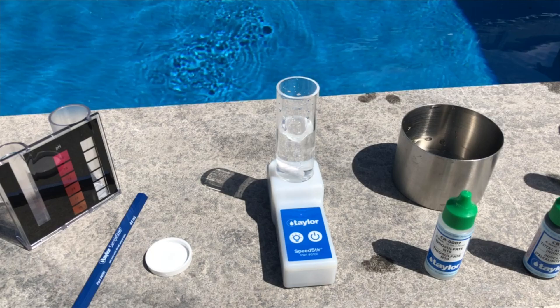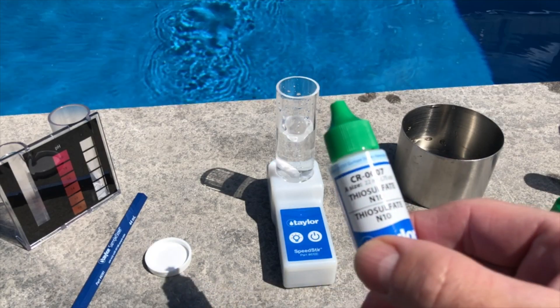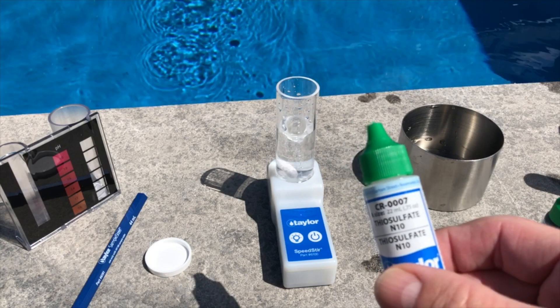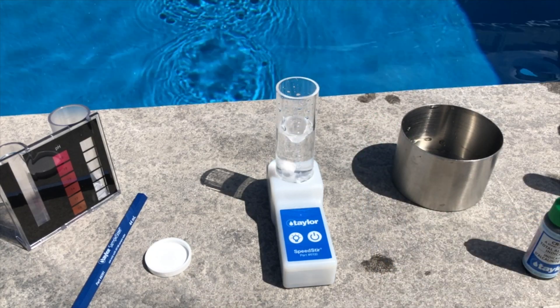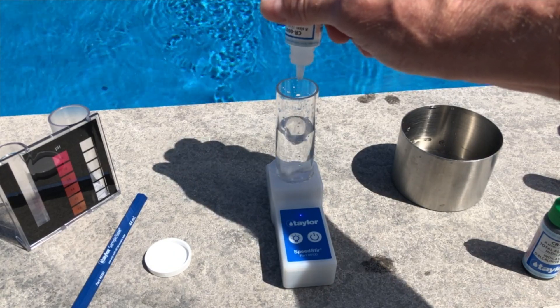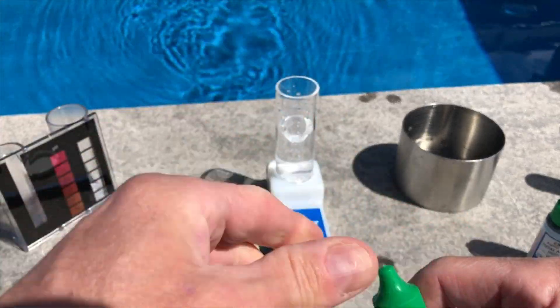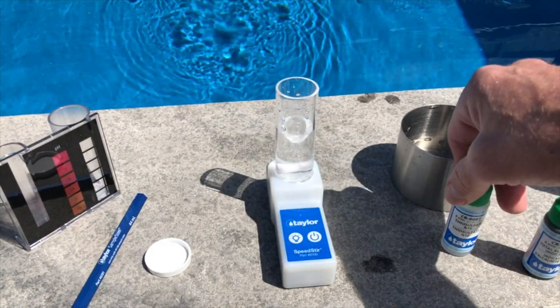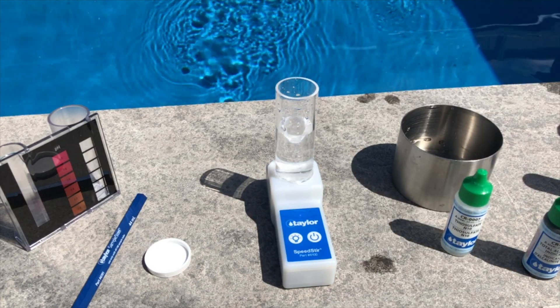The first Taylor reagent we're going to use is the CR-007 thiosulfate. This will neutralize any chlorine that would cause interference in this test. We put two drops of the CR-007 in there.